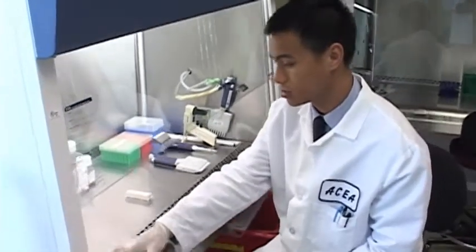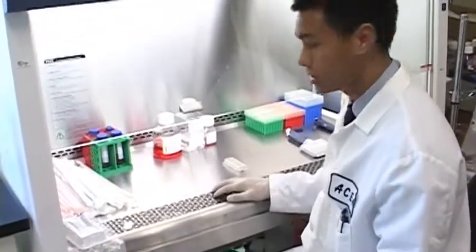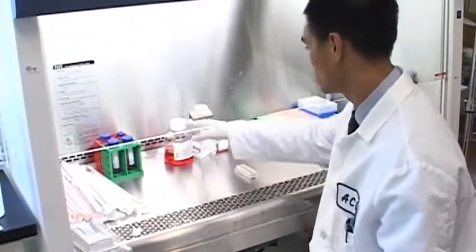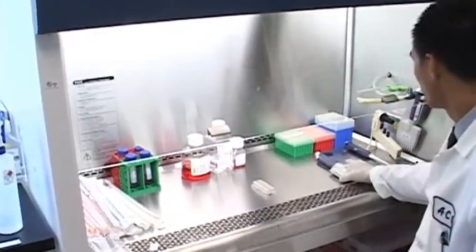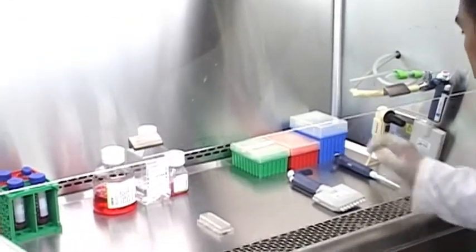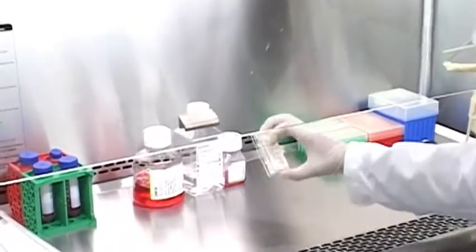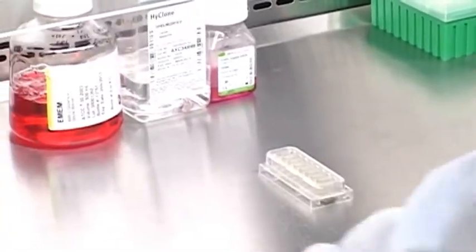So in general, in order to set up and run your receptor signaling assay, you only need standard tissue culture reagents and equipment. And so here we actually have our tissue culture pipettes. We have the reagents associated with our cell type, PBS, trypsin, as well as this full media. We have cell reservoirs for plating. We have our multi-channel pipette, as well as a P20 for cell counting, as well as your pipette tips, and the actual E-plate. As I mentioned earlier, the first step is to take your background measurement.